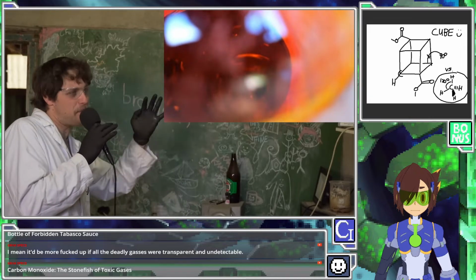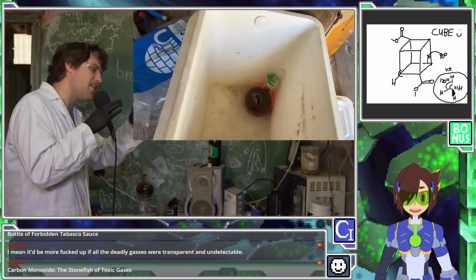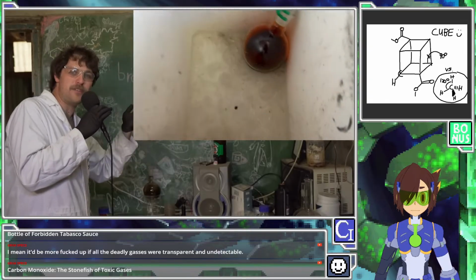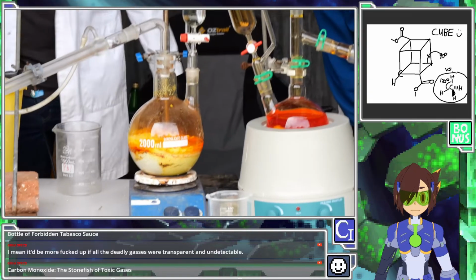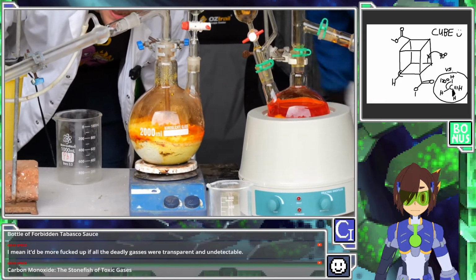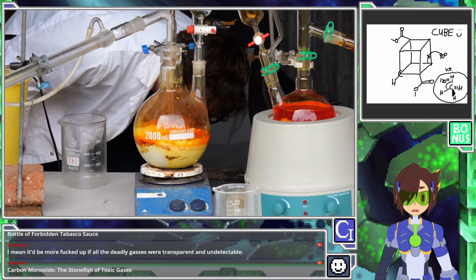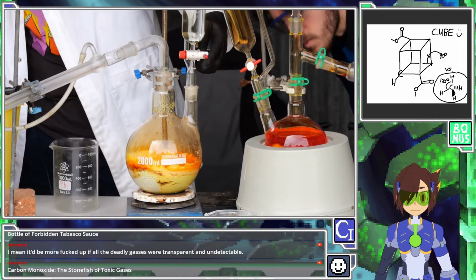That's never a good idea. You don't optimize for speed and cost. And I think that was in part because of so much BrCl that was produced. It's generally produced when there isn't very good stirring, and when we were working in this 2 liter flask it just makes your life more difficult when you have a giant amount of impure crap to purify.